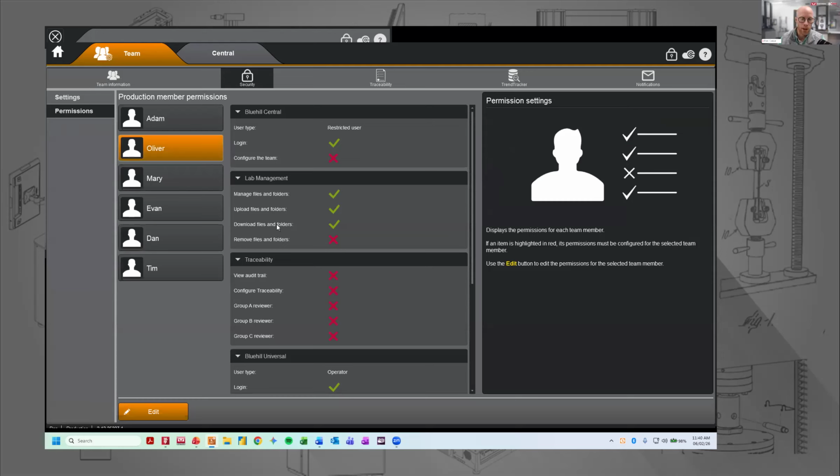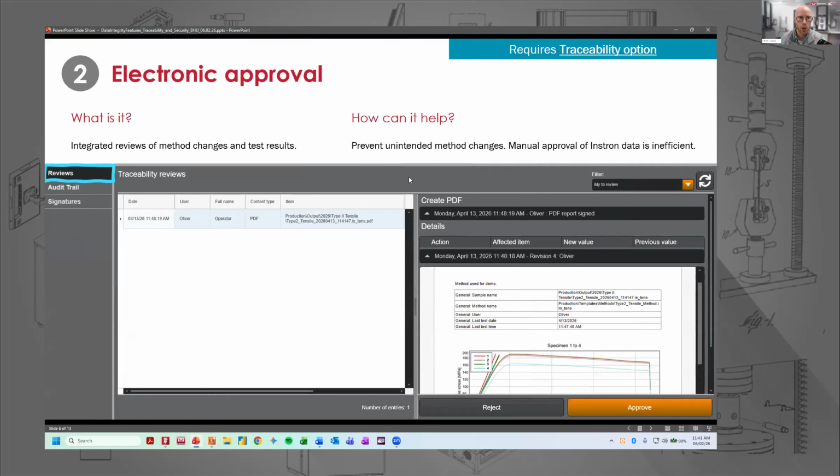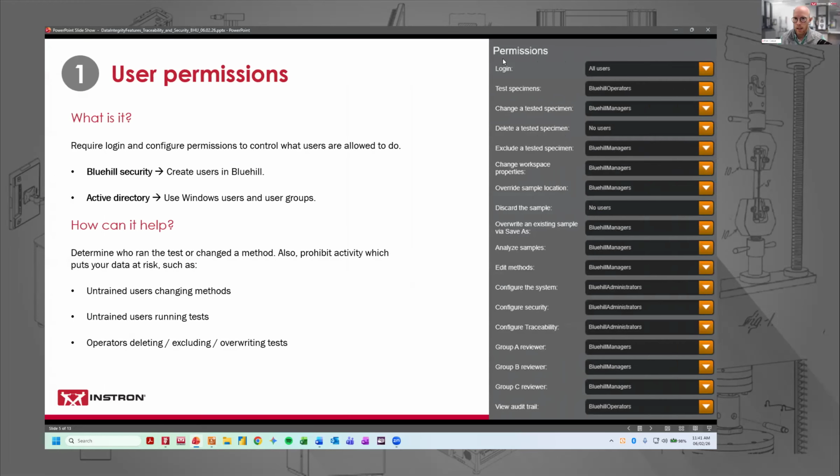If you have Active Directory, it's going to look a little bit different. If I go back to the very first feature, your permissions are going to look like this. They're mapped to user groups. So to prove what a user can and can't do, if you're not going to physically run through all of the actions, which we do when we're IQOQing or validating the system, you would have to go to those user groups on your AD domain and show what user lives within each user group.